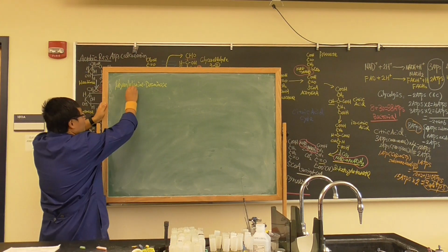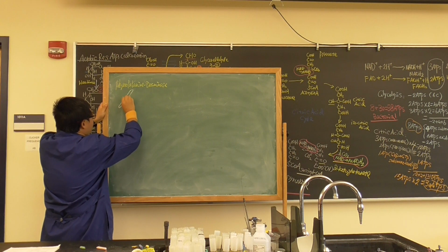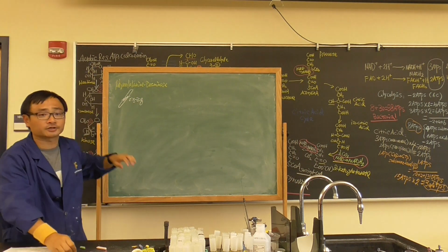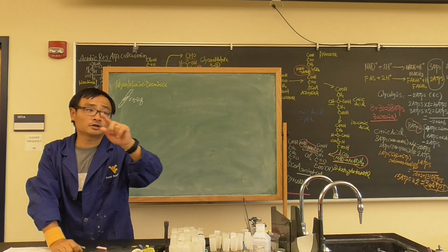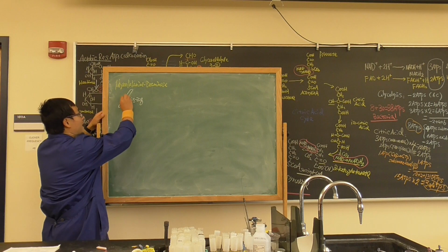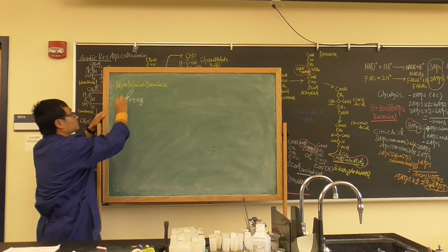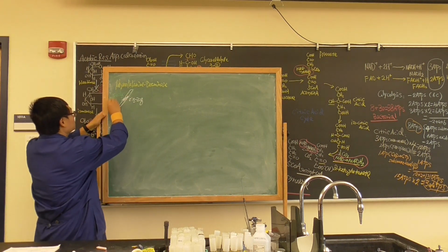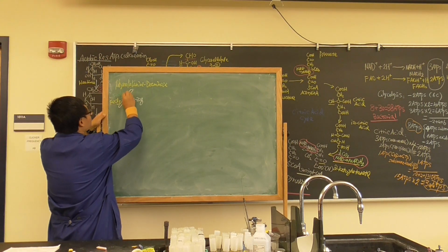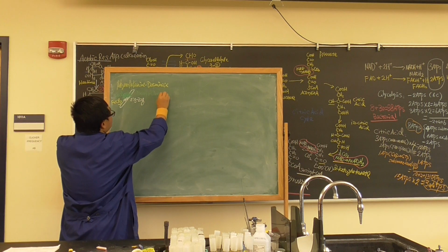Do you remember? Everybody has a tube with a zigzag of bacteria growing there. Did everybody see the marker of the zigzag on your phenylalanine tube? Okay, good. What are you going to do? Add one big drop of ferric chloride, FeCl3. If the color turns dark green, it is positive.